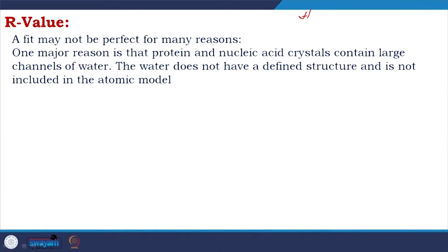If it is an enzyme, it is difficult, because if you add A plus B to get C plus D, in the mixture there will be A, B, C and D. I will explain a little bit. Remember I told you that in crystallography, crystallization is a very critical part, and we all discussed that. Now, to get a crystal, one of the major challenges in the crystallization process is that the sample should be homogeneous.